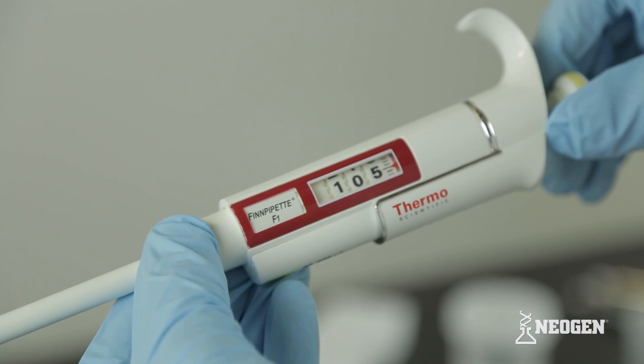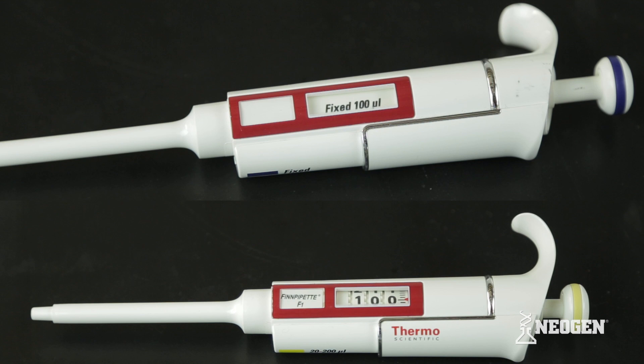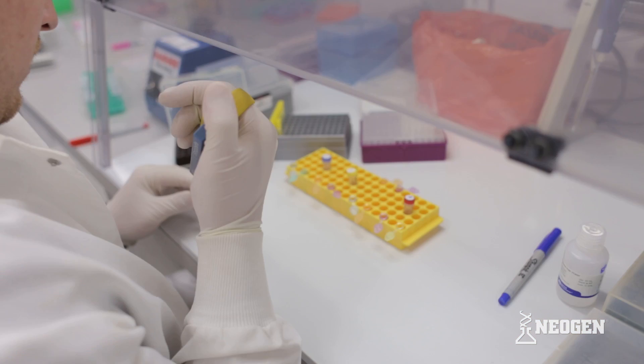This instructional video covers technical practices and procedures for using a fixed or adjustable single channel pipetter with an overfill level. Using correct pipetting technique is necessary to get accurate results with Neogen's test kits.